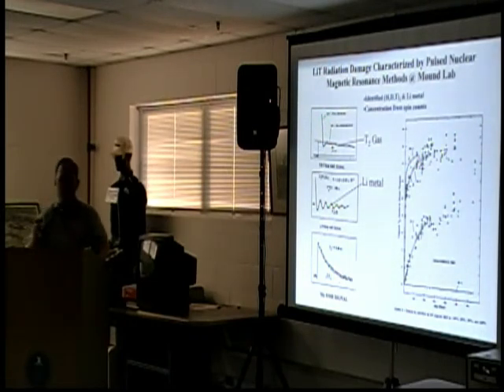This is from the lithium, or from the tritide anions that are sitting in the material. This decay, the long T2, this is from tritium gas. And when we extrapolate that, the initial amplitude tells us what fraction this is of the total amount. Now, we didn't compare to the signal here, but we actually used the water reference signal and converted that to amplitude. This is the lithium NMR signal that we obtained.